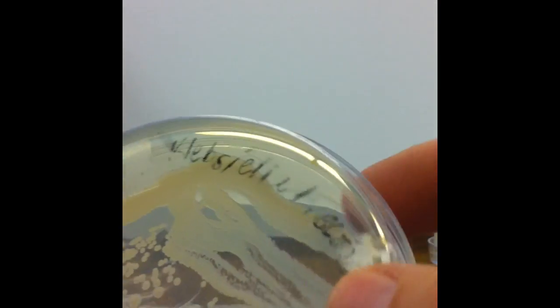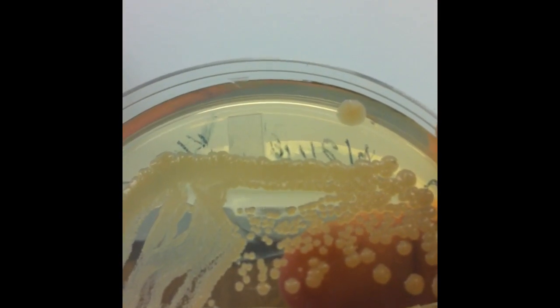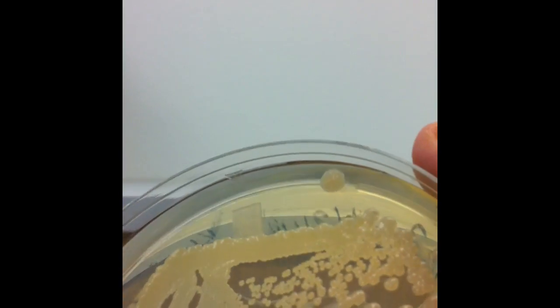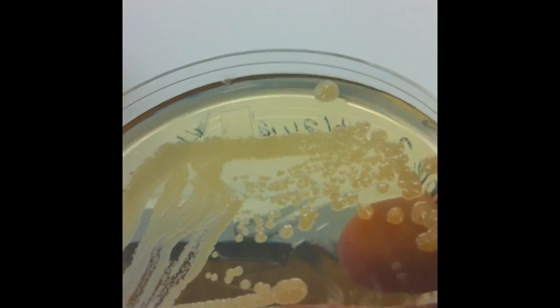And the last one I'm going to show you today would be Klebsiella. This happens to be Klebsiella pneumoniae. We have a more cream-colored, again, round, smooth, and convex shape. These that are about a week old tend to be a little bit tall in the middle, so ever so slightly umbonate.